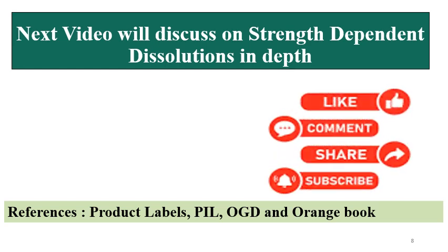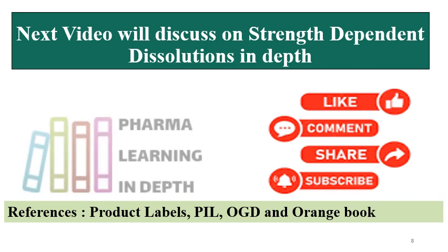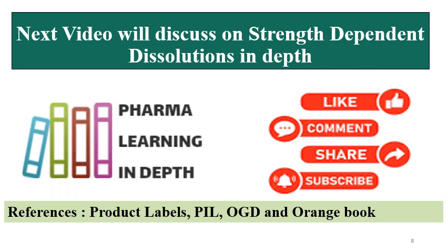For this, I have referred to product labels, patient information leaflets, and the Orange Book. Then I have referred to USP dissolution methods and OGD media.